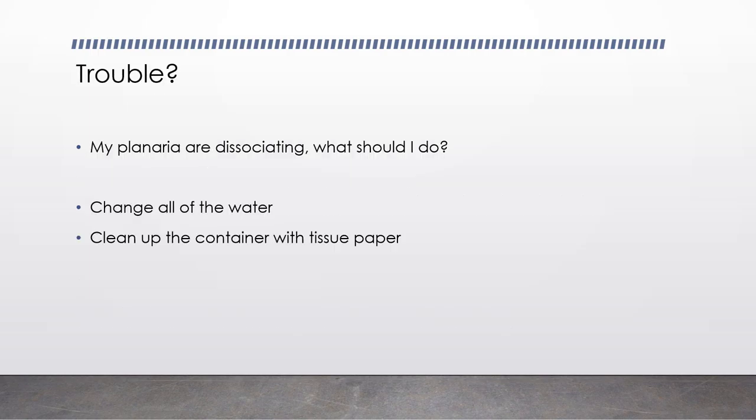Will there be any trouble? Yes, of course. So what should you do when your Planarian start dissociating? I faced this kind of issue during my last Christmas. I was previously culturing them in room temperature, and during the Christmas holiday I couldn't change the water. When I came back and observed, the Planarian culture had become a soup with food remainders and a lot of pollutants. When you face this kind of issue, you should take all the Planarians to a new, clean container with fresh water, and clean the previous container with tissue paper.